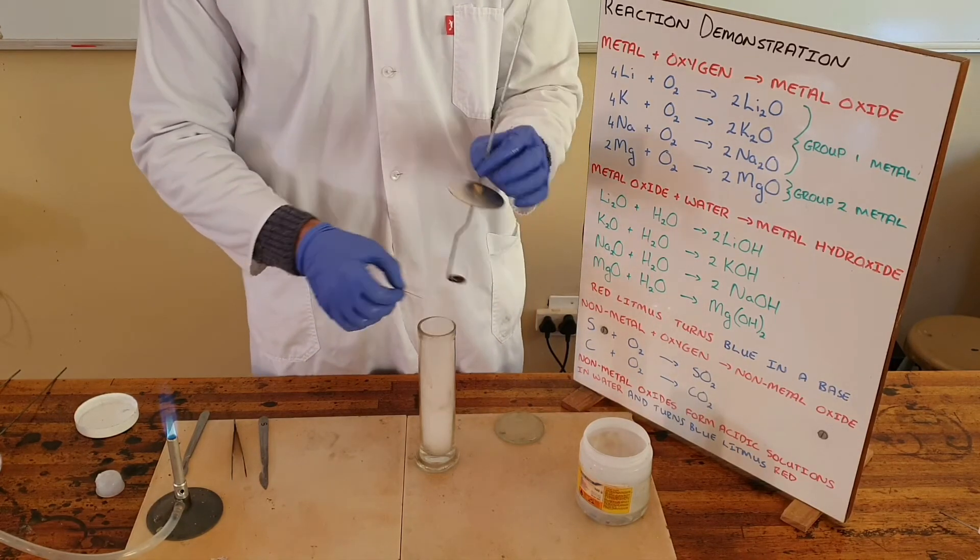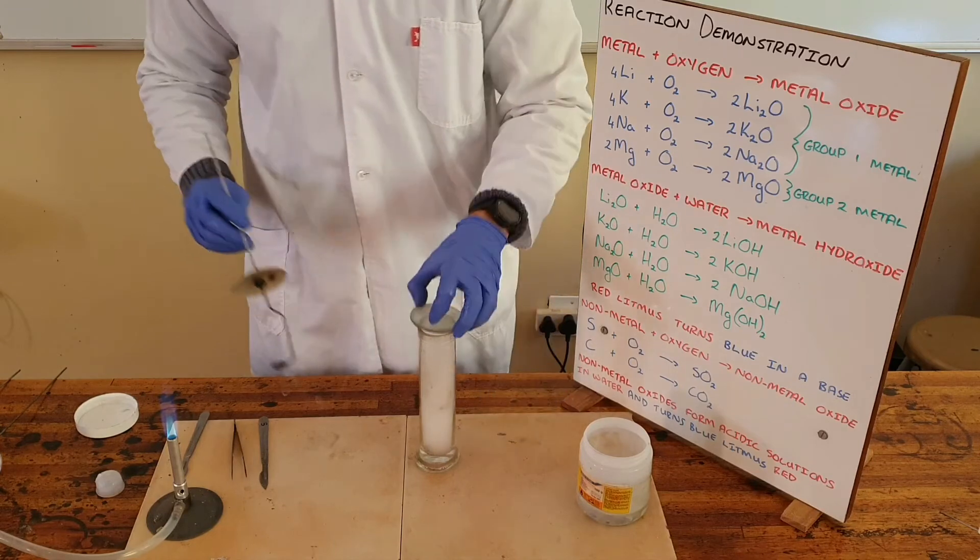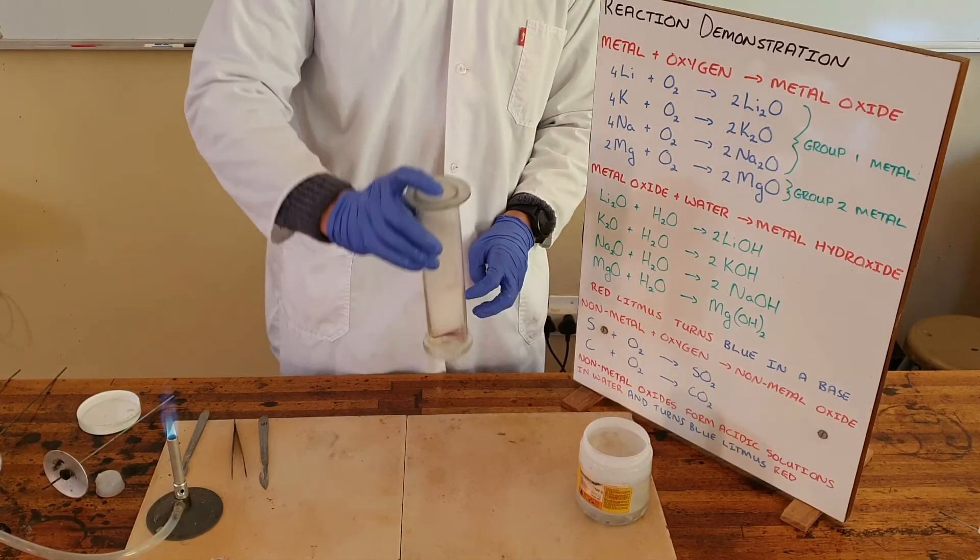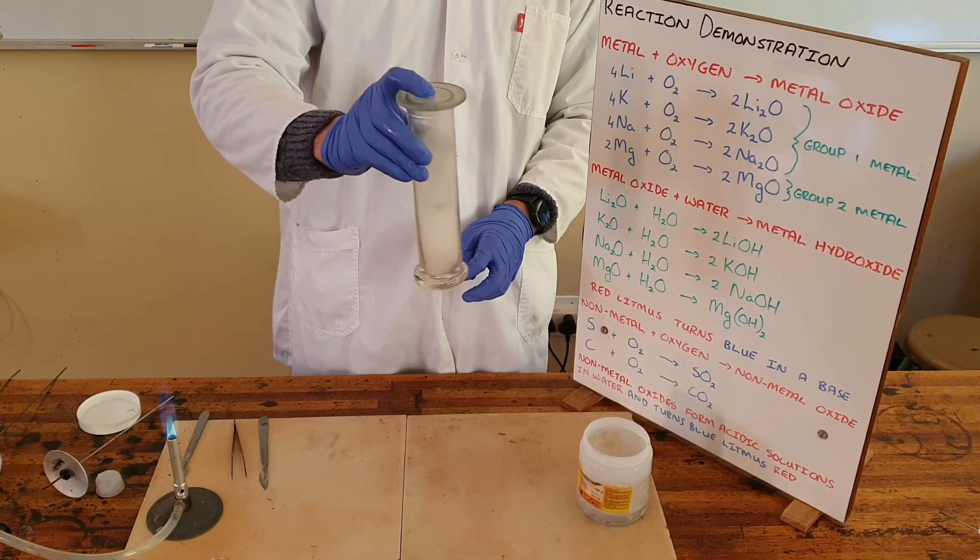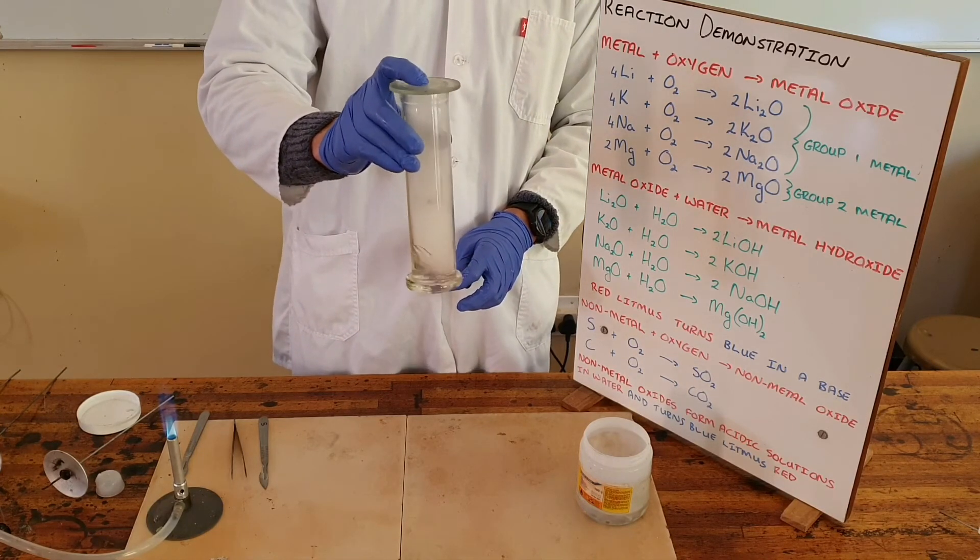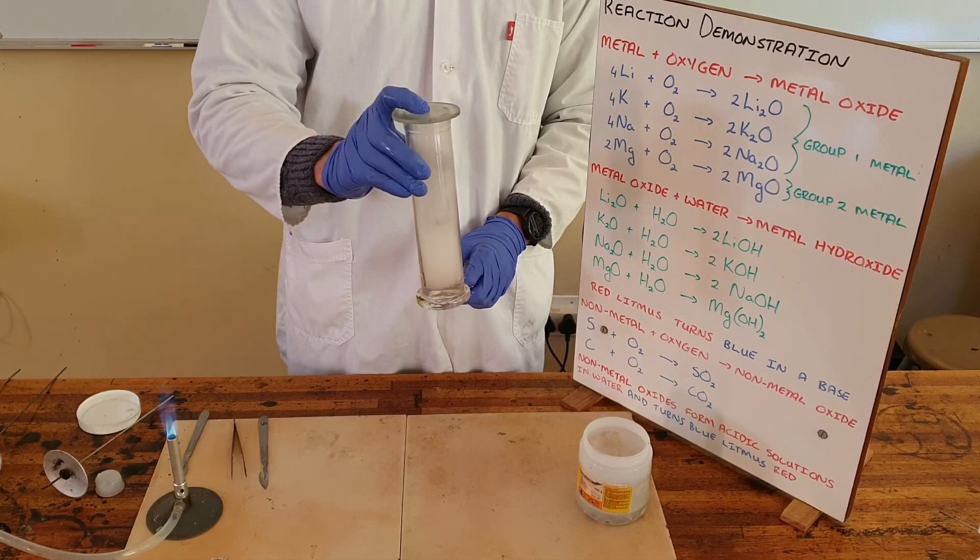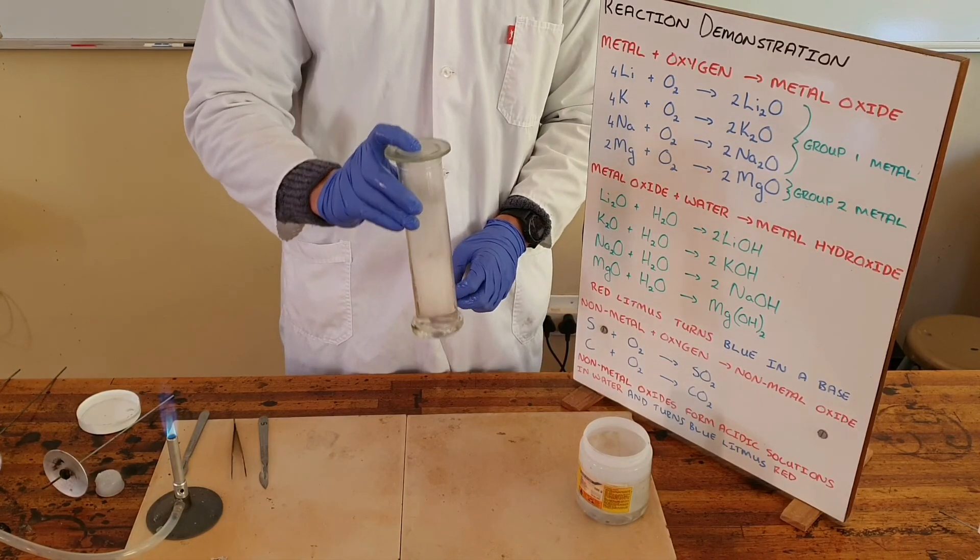We can observe that the red litmus paper changes color to blue almost immediately, once again showing that a metal oxide when added to water forms a basic solution.